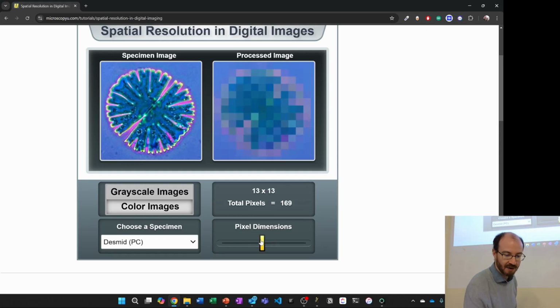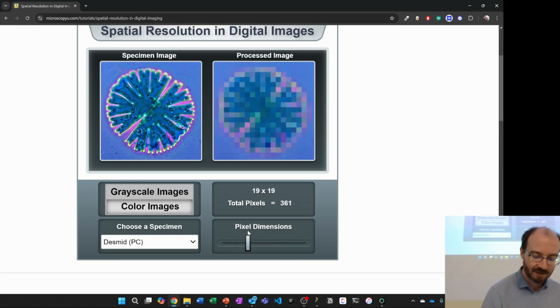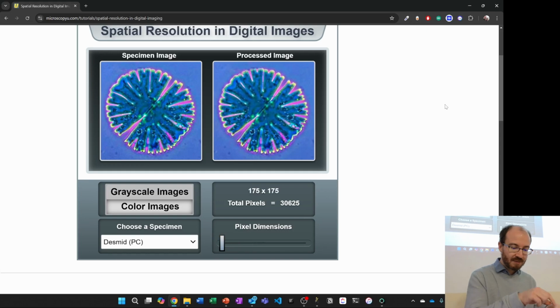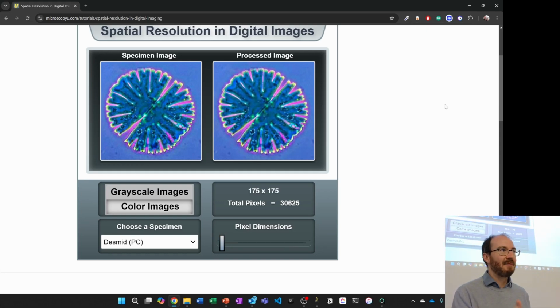So just be aware of this trade-off between spatial resolution and obviously the storage space on the computer. Generally, higher is better, but if you don't need that high resolution for various reasons, such as if you capture more resolution on confocal, you're burning your sample. You're exposing it to the heat of the sun every moment that you capture it, and it's just going to die at some point.